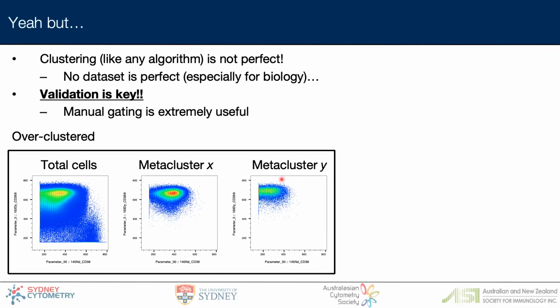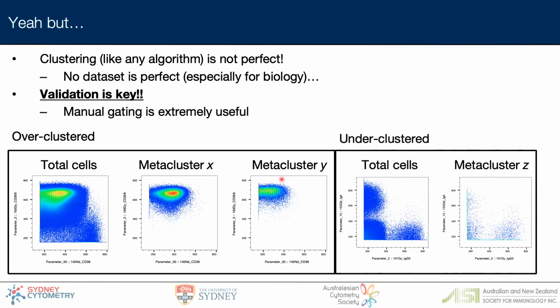At the same time though, in the exact same set of data that I ran with clustering, I got some underclustered data. Looking at this particular cluster, to me, these are clearly three separate populations. So you can get both under and over clustering within your own data set. And like I said before, this was run with FlowSOM as well. Because these populations are so small, it could just be that it's not as accurate identifying them. But again, I ran these with the assumption it wouldn't be perfect, and I don't need it to be for my results because this is where I validate any sort of changes that I find with manual gating.